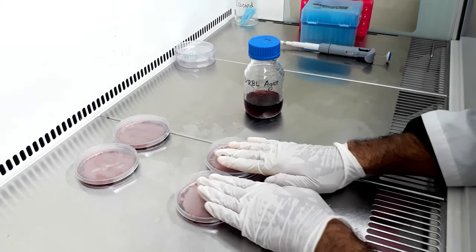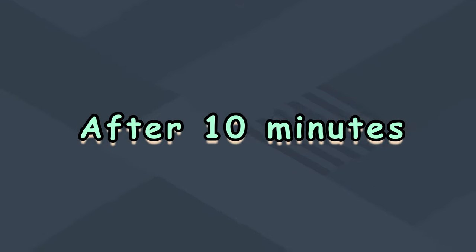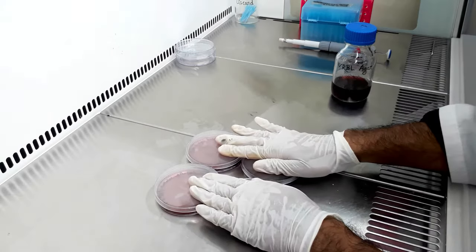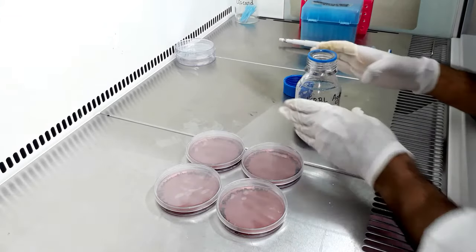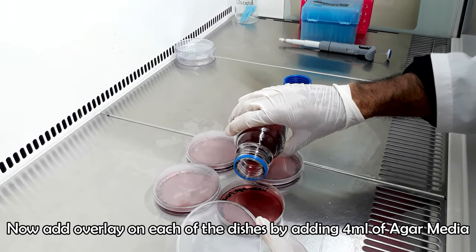Wait for 10 minutes, allowing each of the inoculated dishes to become solidified. Now add an overlay of VRBL agar on each of the solid surfaces by pouring about 4 ml of the media.